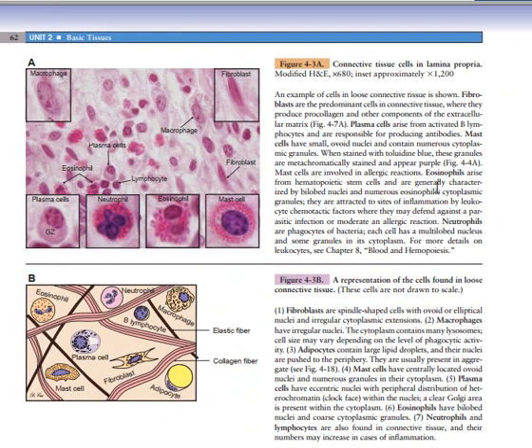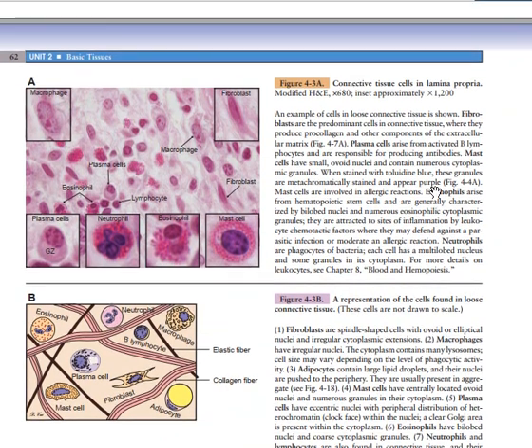The next are the connective tissue cells. We have already seen the plasma cells. Now the neutrophil, how does the neutrophil look? Neutrophils are made up of a multi-lobed nucleus, usually four to five lobes. When you have a four to five lobed nucleus, you already think of neutrophil. The content of the neutrophil can be eosinophilic most of the time, but may also be basophilic.